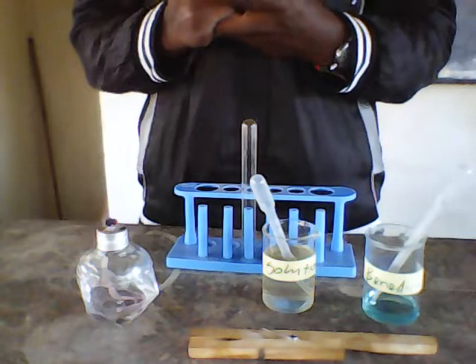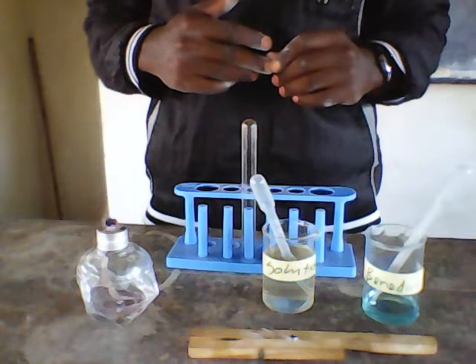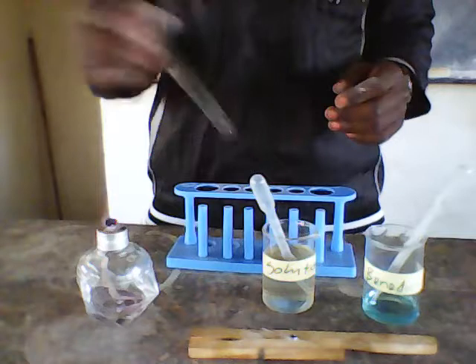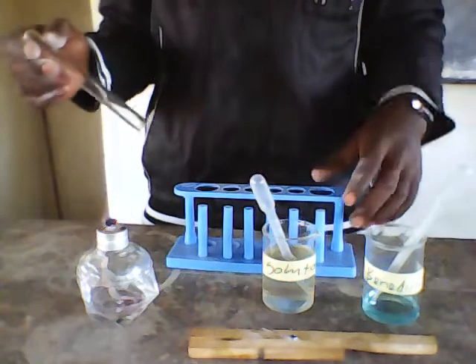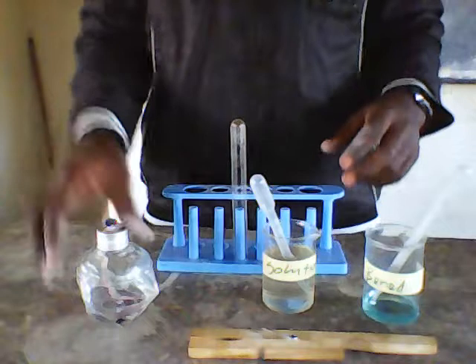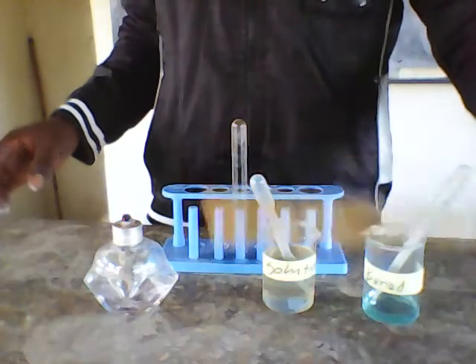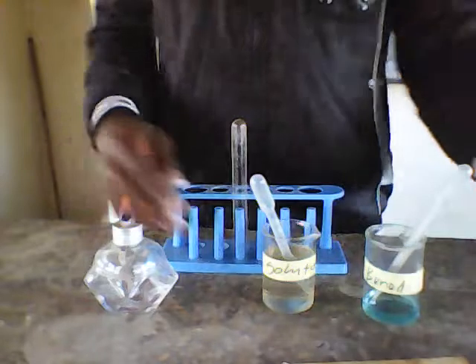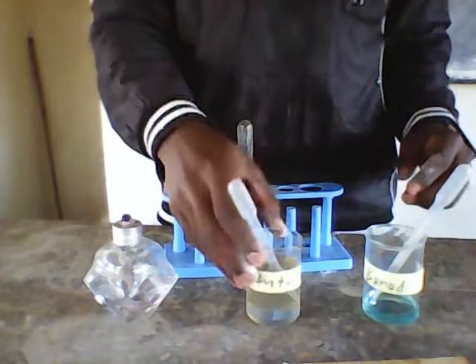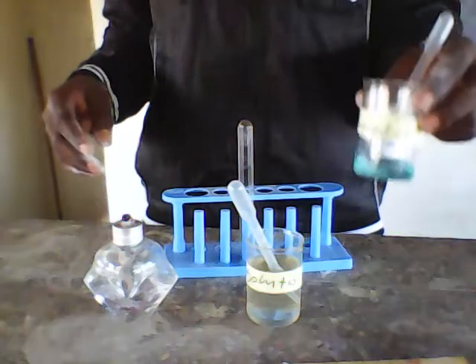I'm going to carry out an experiment on reducing sugar. I have a test tube, a test tube rack, a spirit lamp, a test tube holder, solution X which contains the sugar and water, and the reagent that I'm going to use is the Benedict's solution.